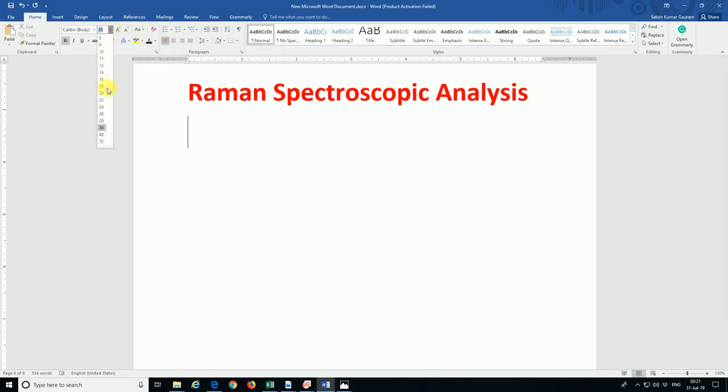Suppose it is an X Raman wave number, so we can take plus or minus 5 or 10.